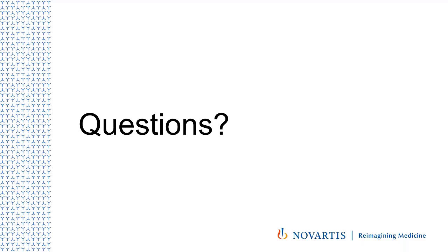Do you think that this approach is appropriate for similar tasks? I don't get the question. Appropriate. I guess whether we can apply this to a different system or a different type of substrate. I'm pretty sure. Our application is quite specific, and so we somehow fine-tuned the convolution algorithm for our data.